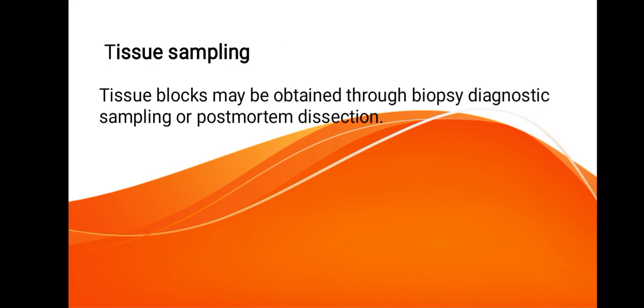The excised organ or sample must be immersed as soon as possible after removal into a reagent. And this reagent is what we call a fixative. And that takes us to our next step, which is fixation.